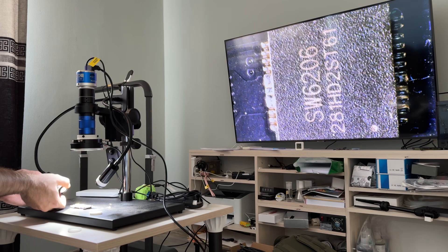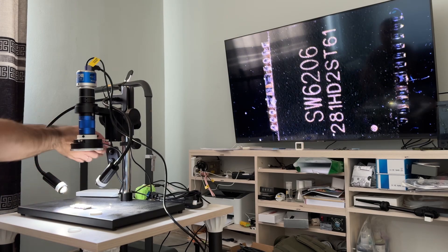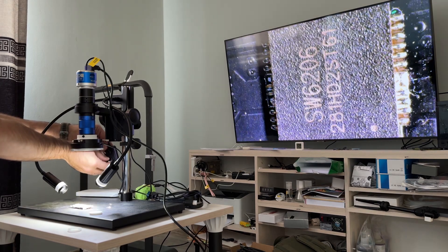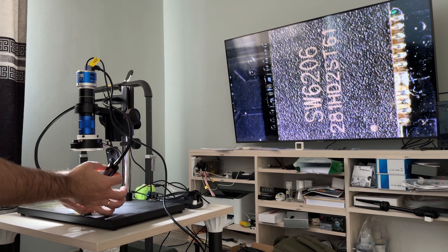You can see here there's no polarized effect. Rotate our filter — wow! And with another light do the same: no effect, then rotate, rotate — wow!